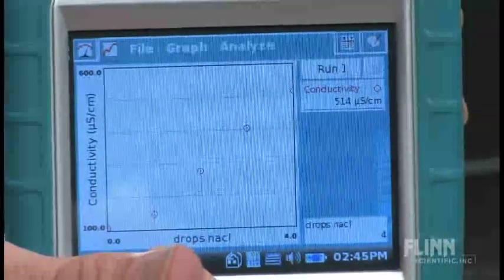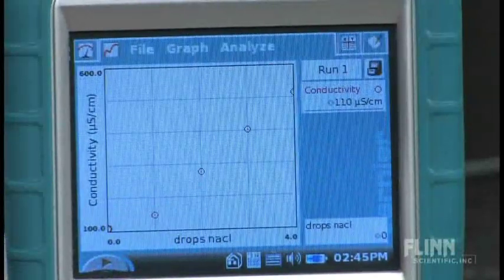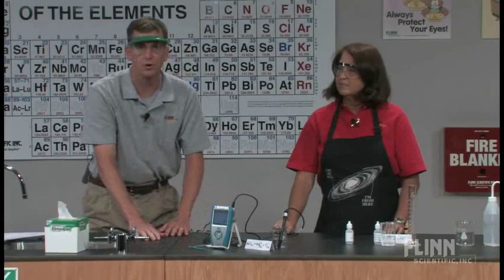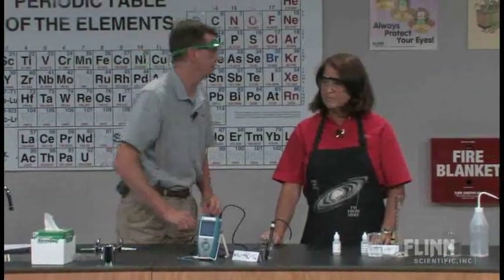I'm going to stop this. What I have is a nice linear graph on here. At this point in time, I'm going to walk over to the board and we're going to take a look at why that slope is the way that it is.